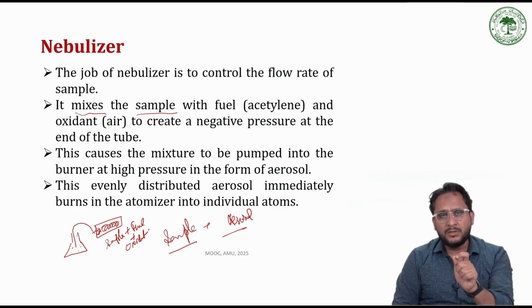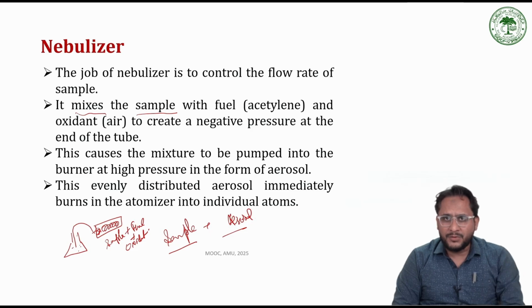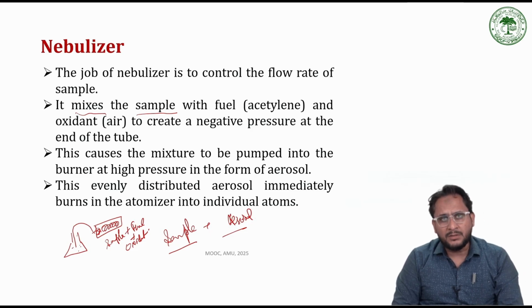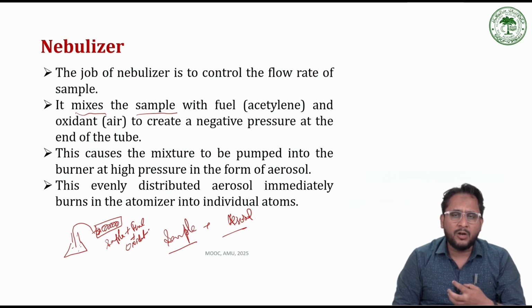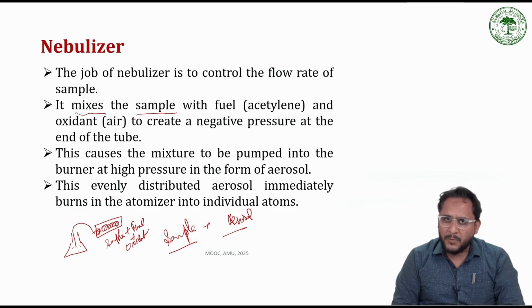Because if the combustion or the burning of the fuel is not proper, if it is not properly burnt, then the energy released is not as expected, and there are chances that all the molecules will not be converted into individual atoms. And since atoms are not formed, there will be no absorption, resulting in a spectrum which is not the actual characteristic spectrum of that particular compound. So it will hamper the analysis.